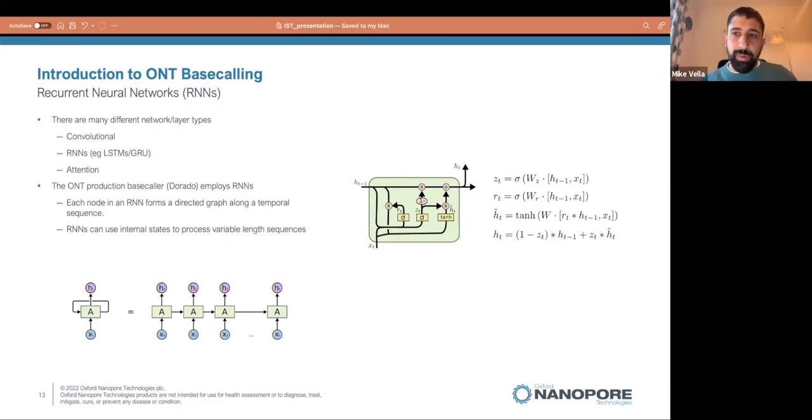And that's where transformer models and the attention mechanism are quite powerful, because they're very good at solving that kind of problem. In DNA sequencing, we don't really have that kind of problem. The relationship between different nucleotides in a pore and how they affect a sequence is governed by likely a much simpler process. And so RNNs seem very well suited to this problem.